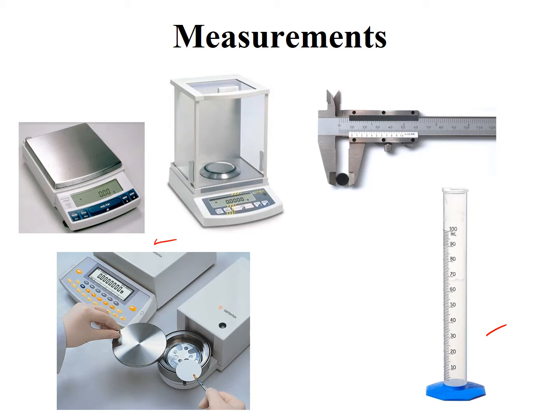Now in this experiment, you're going to use an instrument that's known as a caliper. It is used to measure length, usually small or shorter lengths, in this case centimeter level or shorter than that. And we're going to use the International System of Units, which is abbreviated as SI.